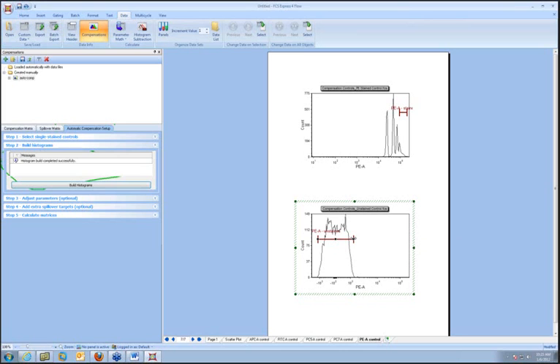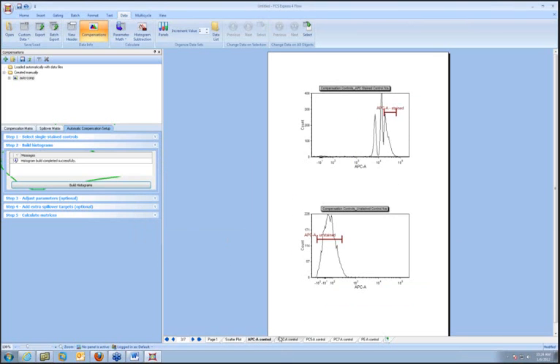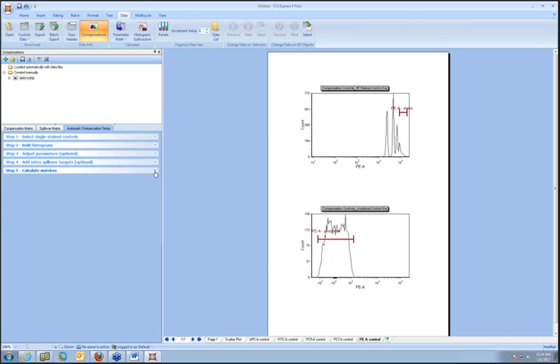Okay, so we've done the first two steps. We've made our scatter gate, and we've gone through and made our controls. The last thing we have to do is calculate the matrices. You can choose if you want to calculate your matrices based on the mean or the median of the various populations. Median is the default. You just click Calculate Matrices, and then we're done.